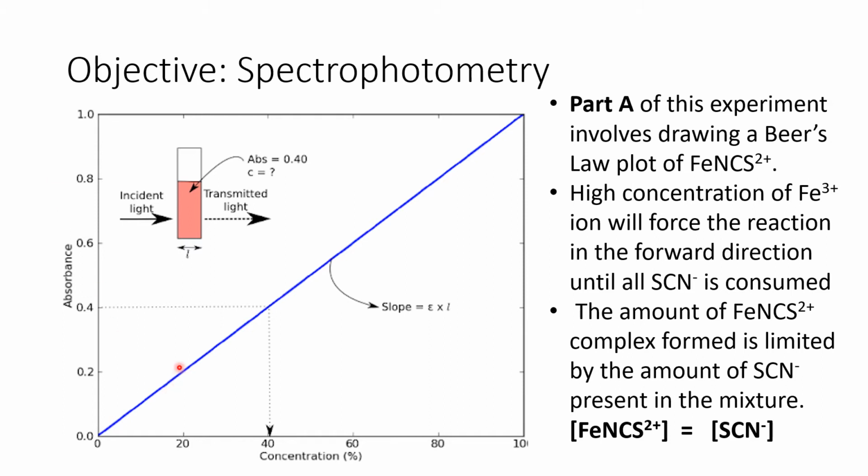So basically, spectrophotometers measure something called absorbance. You have a cuvette, which is a little tiny cup, a little container where you can put liquids, and it has a square shape if you look at it from the top. And what happens in spectrophotometers is that a measurable amount of light will go in, and then light will be transmitted out.